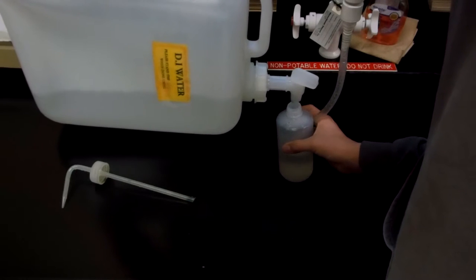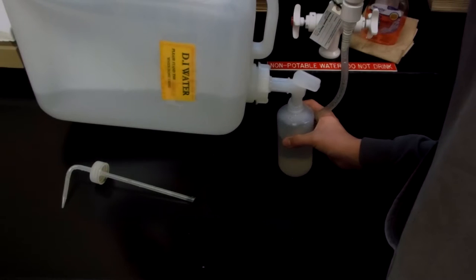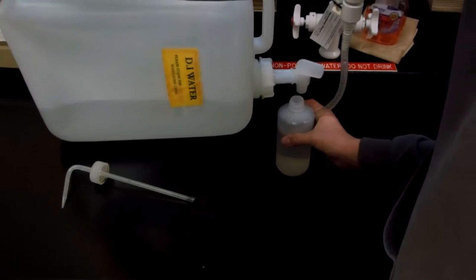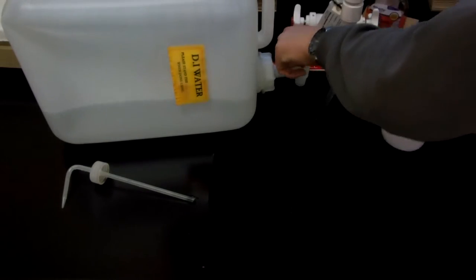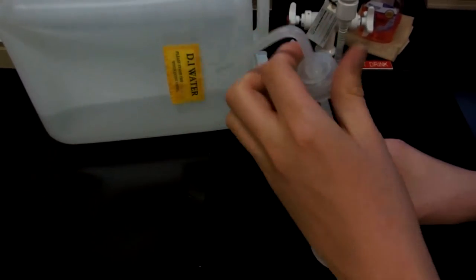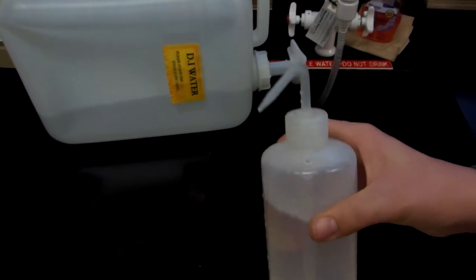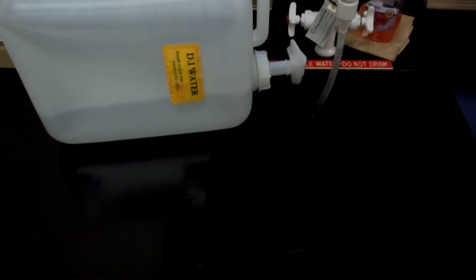I basically twist the knob on the water tank and begin filling. And when I am done, all I have to do is twist the knob on the valve to the closed position and replace the cap on my wash bottle. It's now ready for use, and I will go to the next step in preparation.